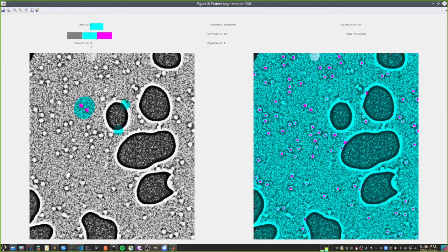So boom, but it also removed a lot of volume inside the true fibers. So it's like you remove and it removes too much, and then you add and it adds too much, but eventually you want it to converge. But it's usually not such a big problem. It doesn't take very long, this process.